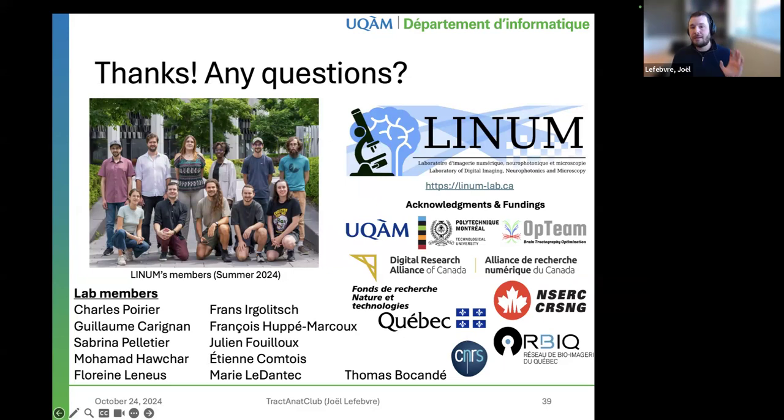All the community that did serial electron microscopy started working on data formats like the Zarr format, and the OME-Zarr convention for the metadata that is specialized for this. And the Zarr format can also work with Dask, so we can do distributed computing on clusters in the cloud. So in my opinion, the main limiting challenge, if we want to map a whole human brain, is the data and the neuroinformatics tools to deal with that data. Okay, thank you.